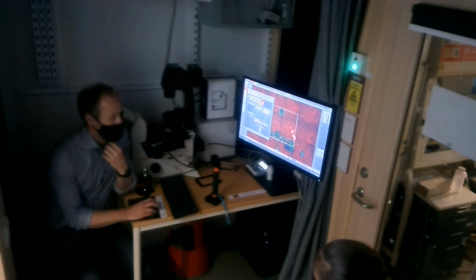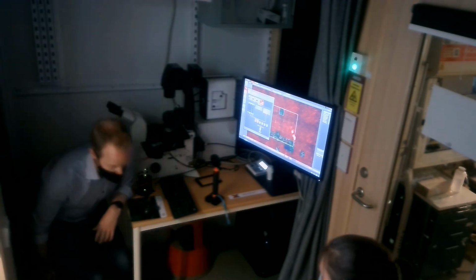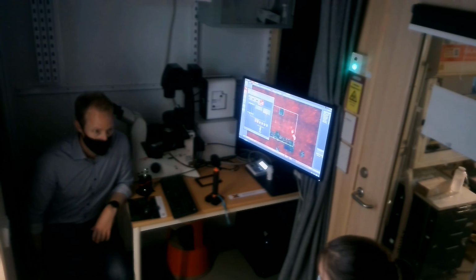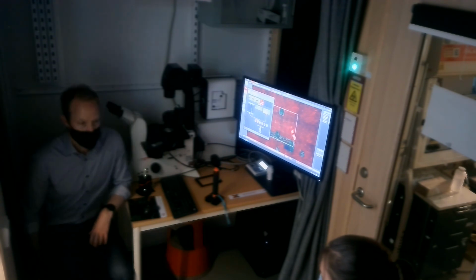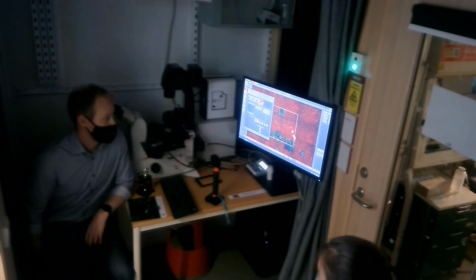Yeah, exactly. Between bright field and the other types of transmitted light contrast methods, the focus is very often not in the same position because you're not looking at exactly the same things. So I would suggest picking whichever channel is perhaps the most important.